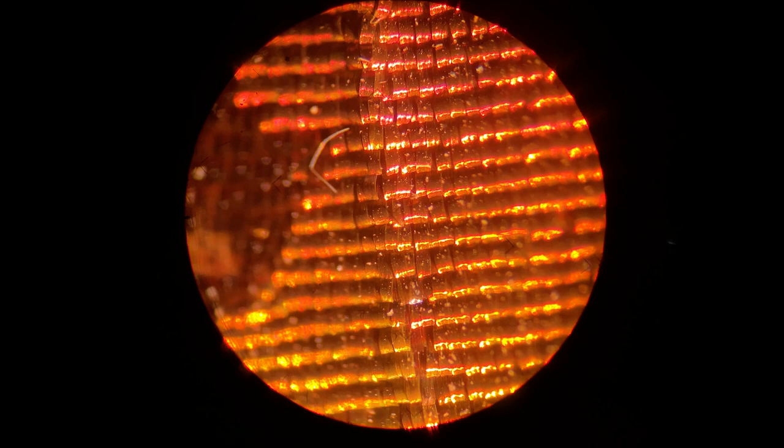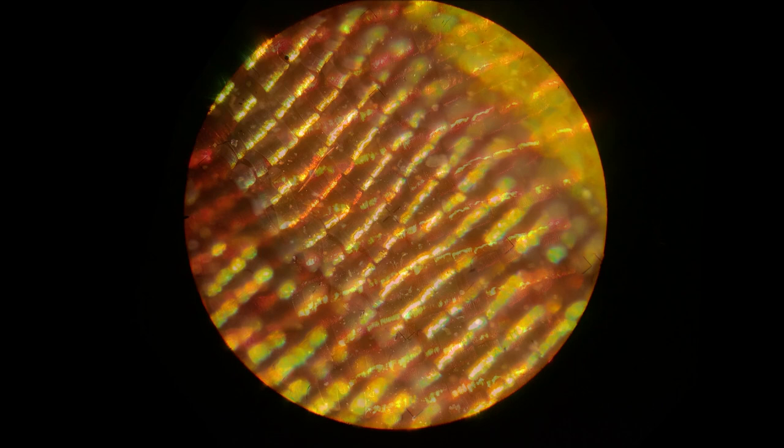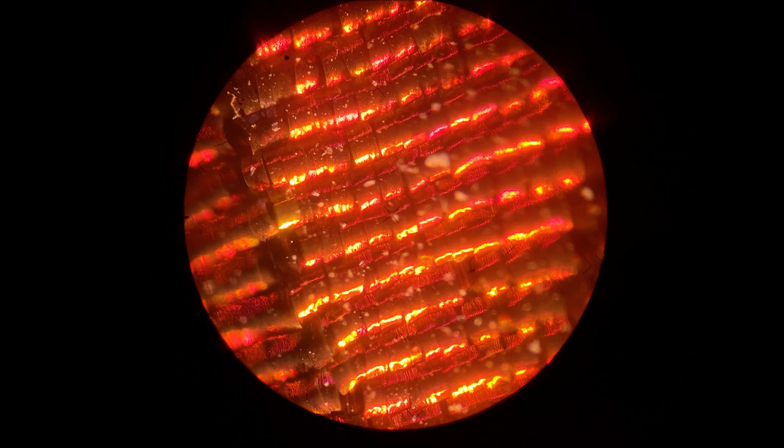This was kind of a bluish greenish part. Oh no. Here's the green. That red. It looks like it's glowing. And here's a super close up. It's hard to get everything in focus because the depth of field is so shallow. But they look like super shiny ribbons or something like that.